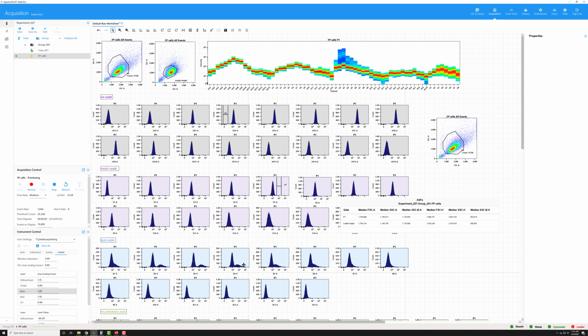However, since we know these cells are large and the ASF needs some adjustment, I recommend that you optimize the area scaling factor first, and then if further adjustment is still needed, we can go revisit the Cytek assay setting gains. So let's go on and adjust those ASFs.